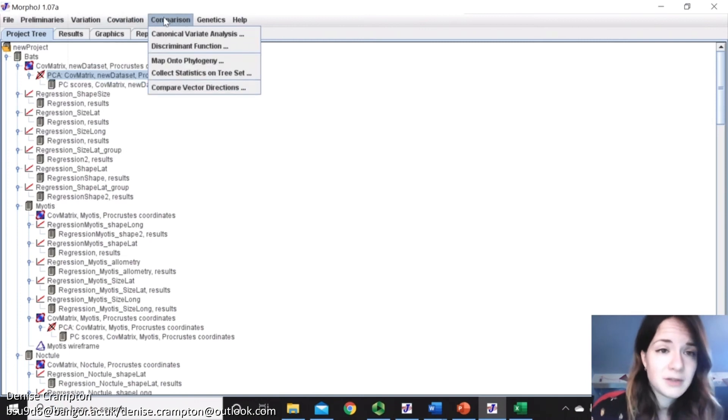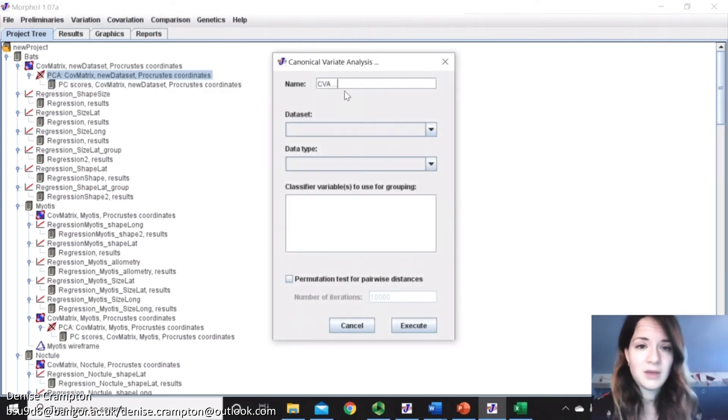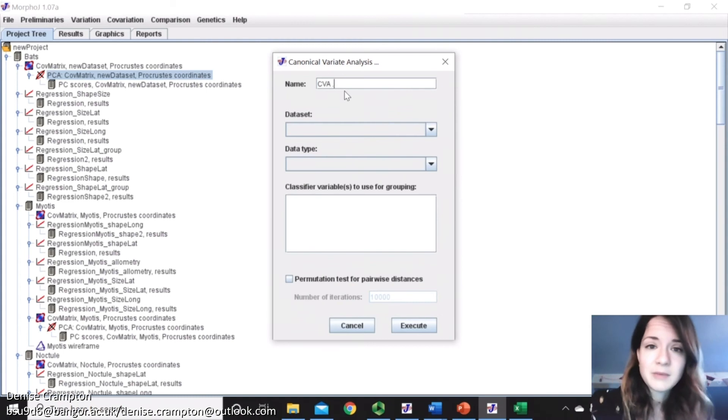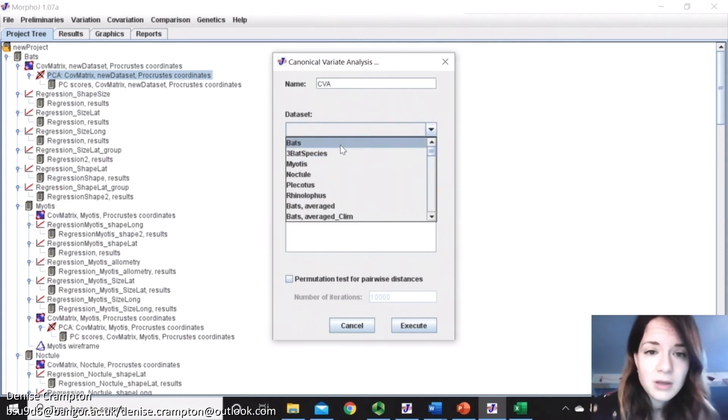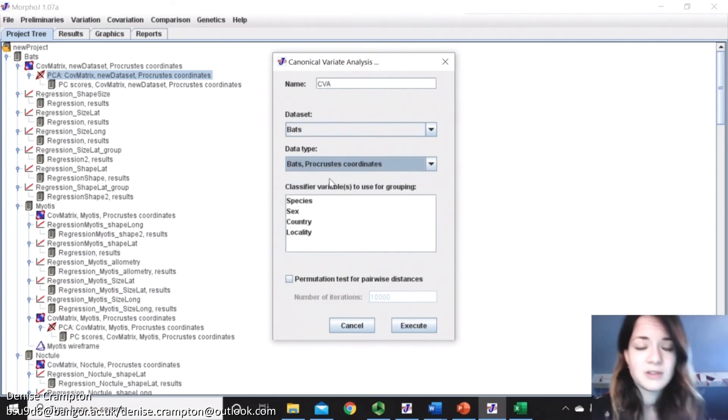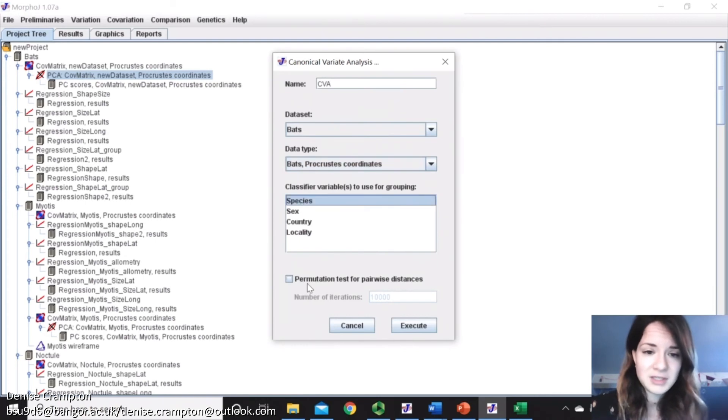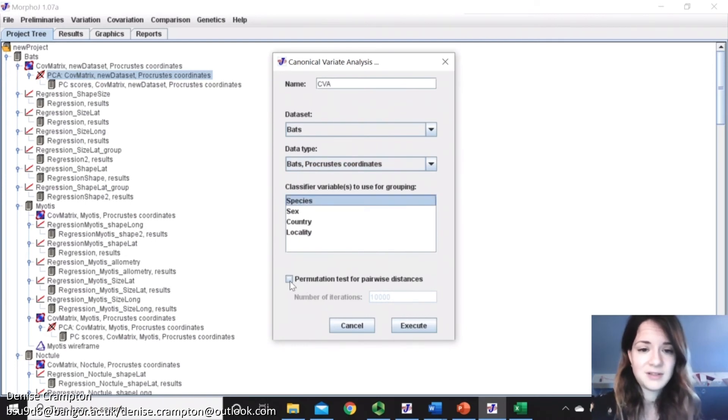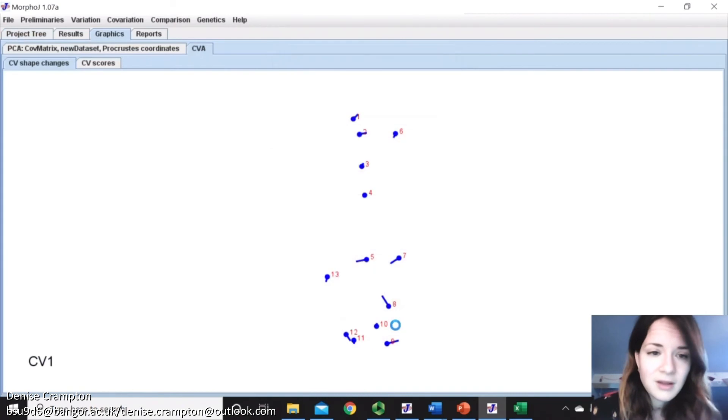So then we go to comparison, Canonical Variate Analysis. Now we give it a name, and then we pick what dataset we want it to be on. So the whole bat one. I pick what we want to do on the Procrustes coordinates, and then how we're going to want to compare the groups. So by species, permutation test, pairwise distances, we can get a p-value, and then execute.